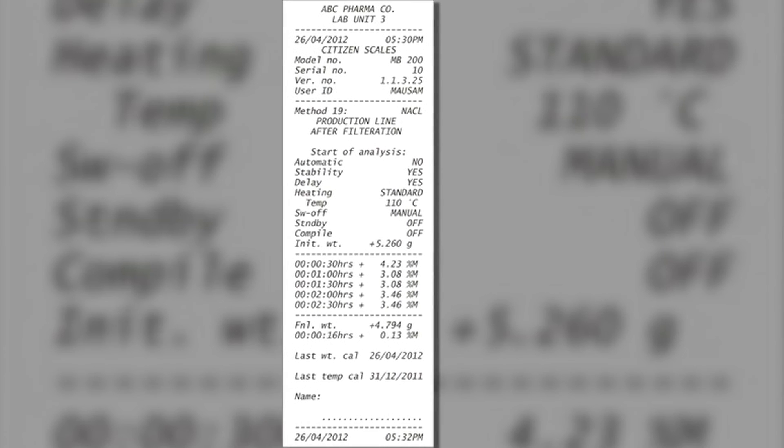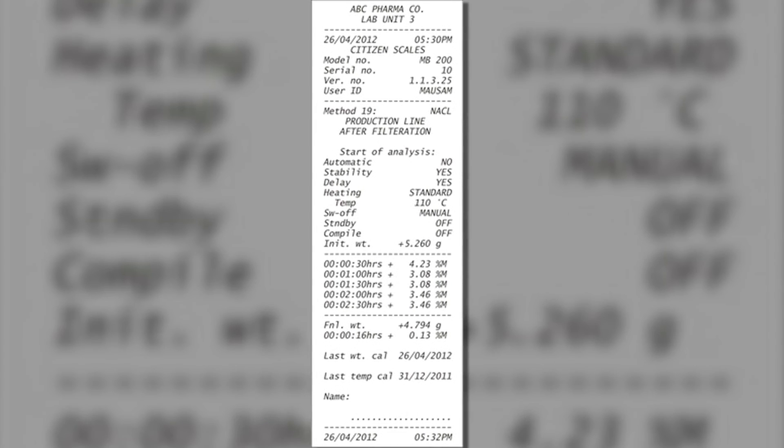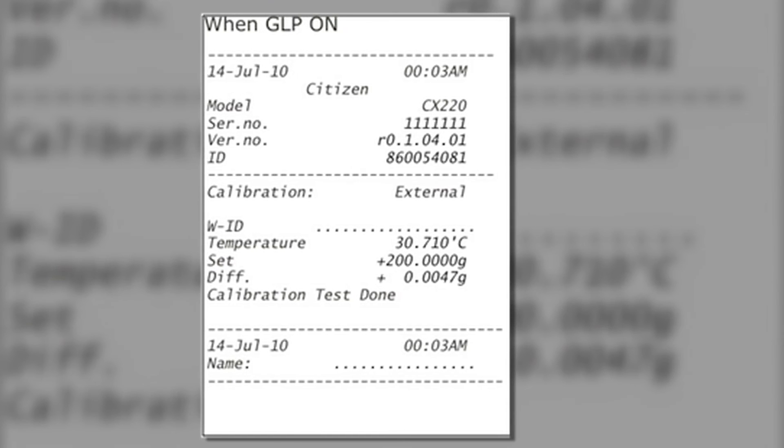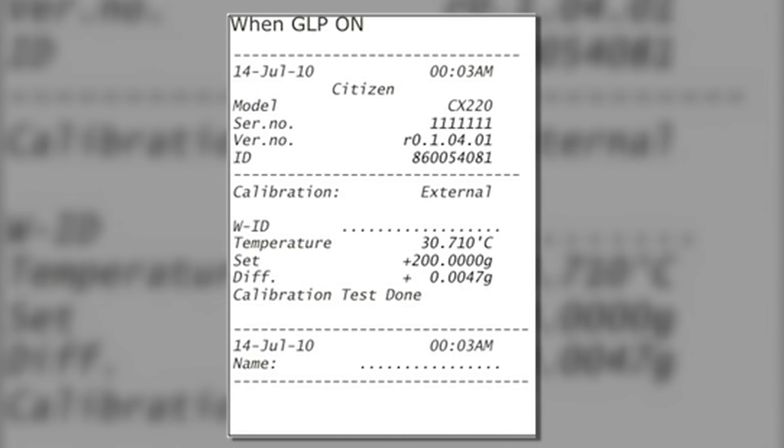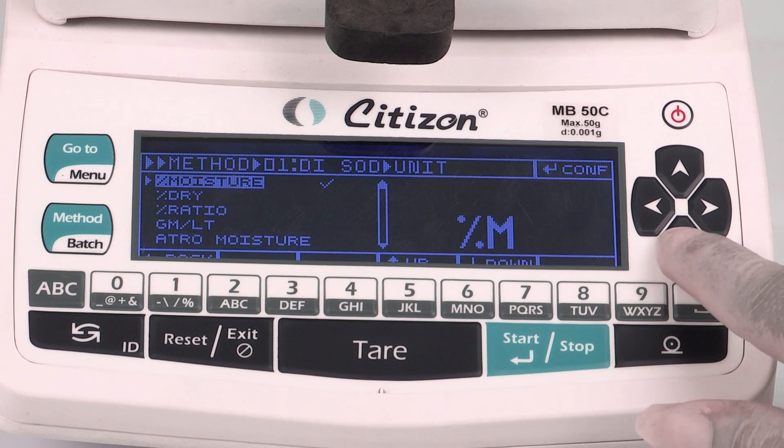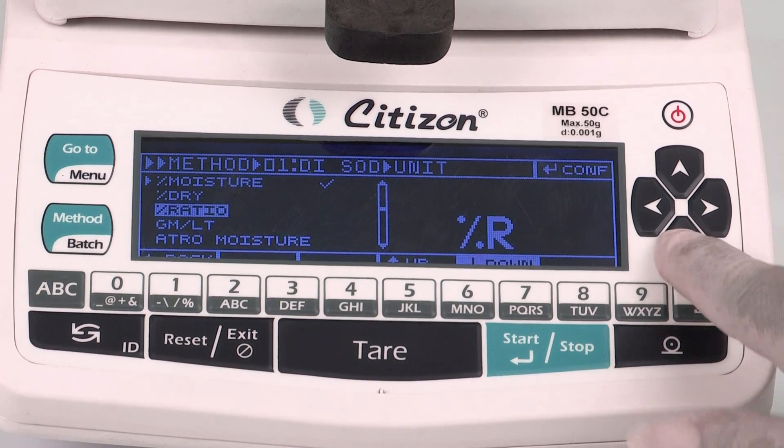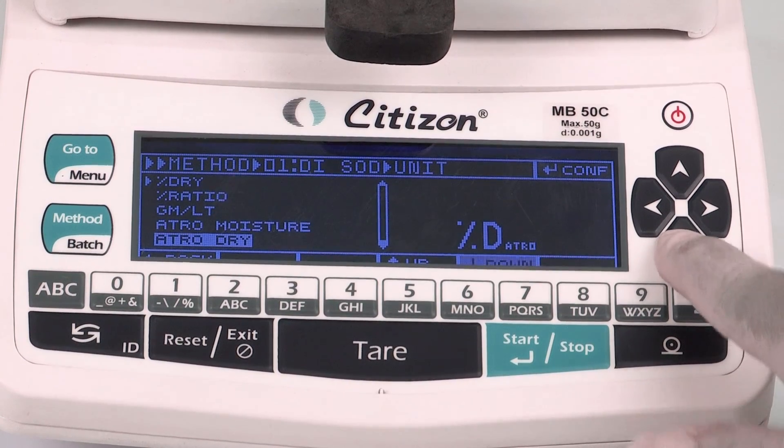The customizable print result allows getting the GLP compliant print results with the required names and in desired format. MB offers the option to view the results with different units, extending great flexibility and convenience.